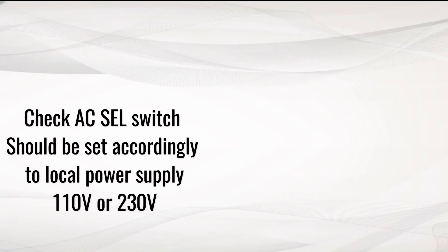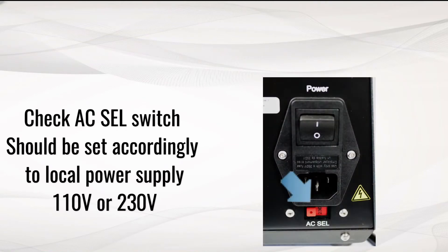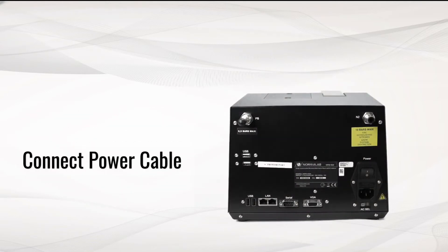For connecting your unit to power supply, check AC selection switch for the right voltage. Connect power cable.